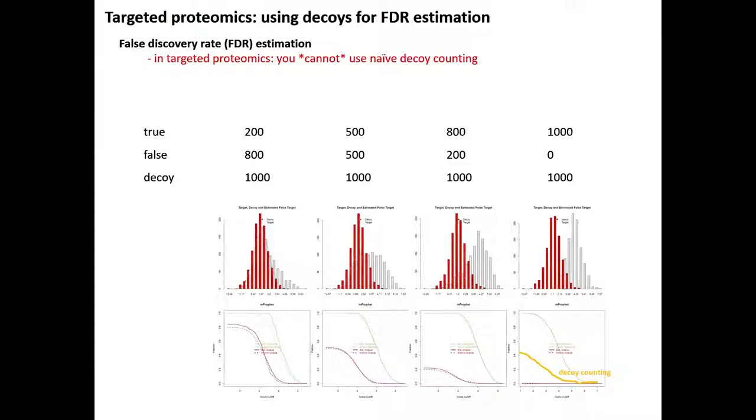But I think you're also referring to peptides that are correct in the DDA library, but that just don't exist in the sample or are not detectable in the DIA sample, so making this library larger. But I guess you will say something. Isabel will say a little bit about this, I think. Brenda, do you want to say something?